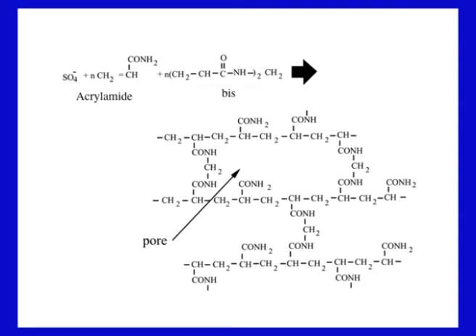All right. So, this figure shows the acrylamide molecule, and this is bisacrylamide. Long chains of acrylamide are formed, and in between the chains bisacrylamide gets inserted. As this cross linking occurs, depending on the concentrations, the pores will be created. Polymerization is initiated by the addition of ammonium persulfate, which acts as an initiator, and TEMED as an accelerator. TEMED is tetramethylethylenediamine.